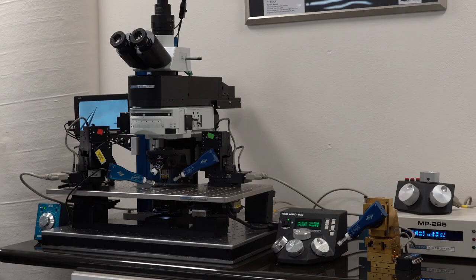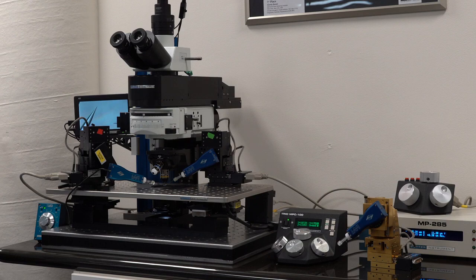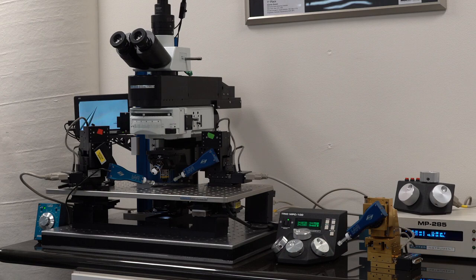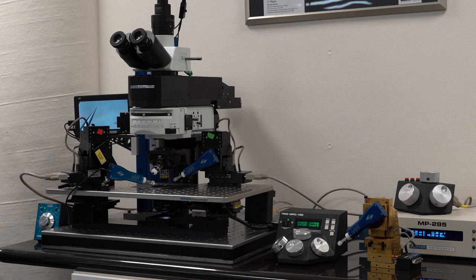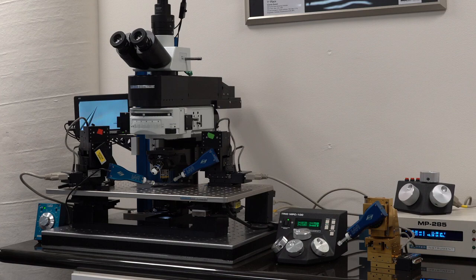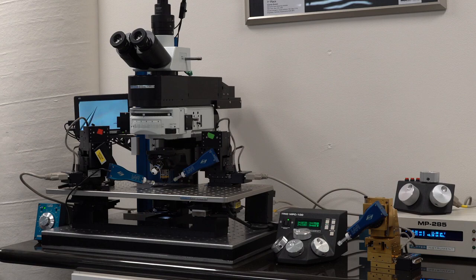This is a two-photon Bob. It makes use of components originally designed for the Sutter DF scope. That scope was built on an Olympus BX51 frame. Because of the Bob's modularity and similarity to the Olympus BX, we can move the same components over to the Bob frame and make a scope we call Bob 2P. I should also stress that the two-photon components in either the Bob 2P or the DF scope are identical to those used in the MOM.